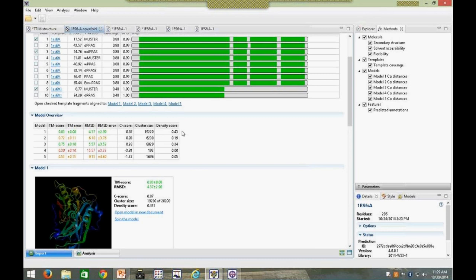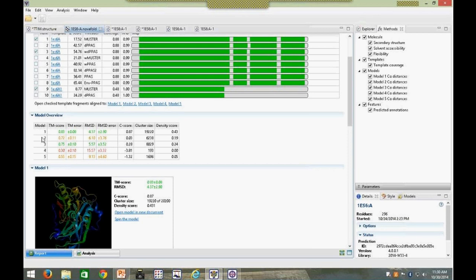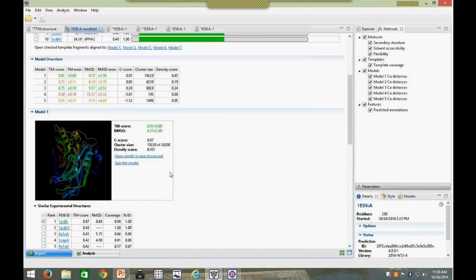Scrolling down, the model overview window displays metrics for all prediction models at once. The TM score, or template modeling score, ranges from zero to one, with one being best. The RMSD, or root mean squared deviation, ranges from zero to about 30, with lower being better. The C-score, or confidence score, should also be as close to one as possible. Cluster size is the number of similar structures identified in the simulation — a larger cluster size indicates a lower energy conformation, associated with biologically relevant structures. The density score looks at tightness of the cluster, and higher is better for both.